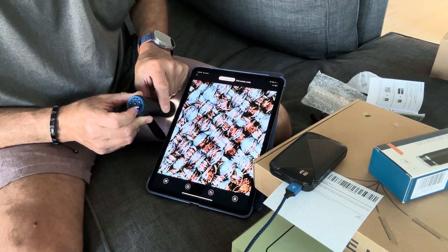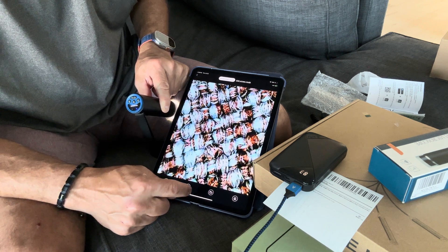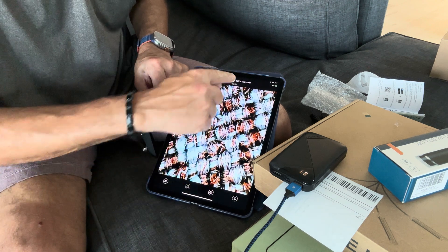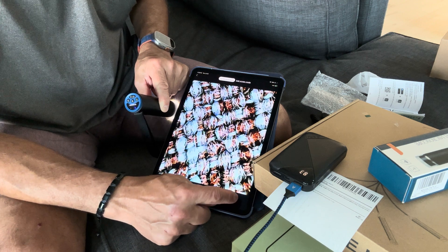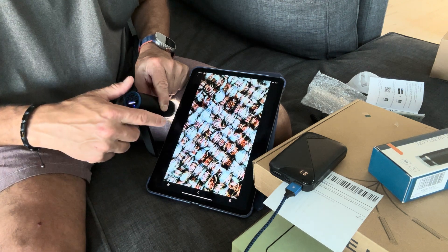Let me see what the buttons do — oh that takes a picture! Now it's recording video; I can see it's a three-second clip. And this button lets me look at the ones I already took — so that's the pictures I took. I'll hold down the power button to turn it off — and yep, now it's off.